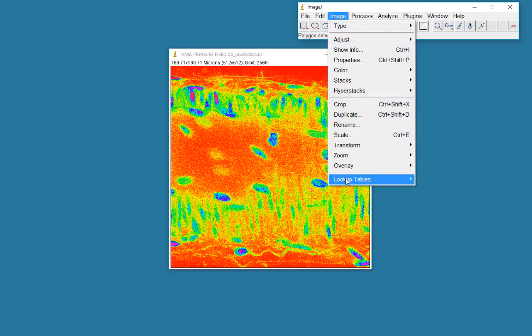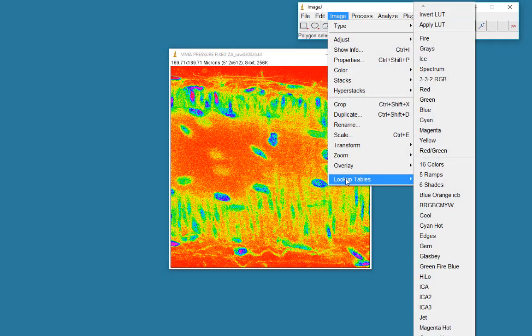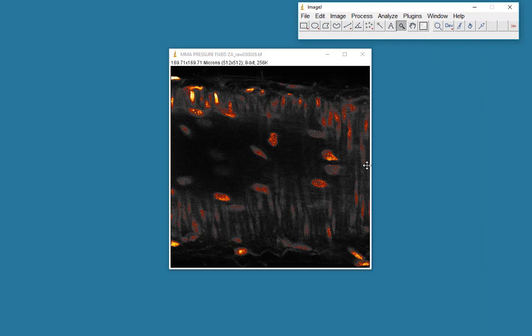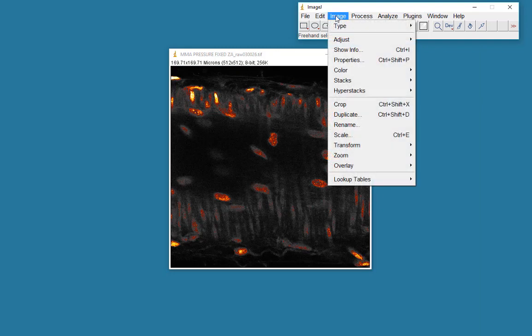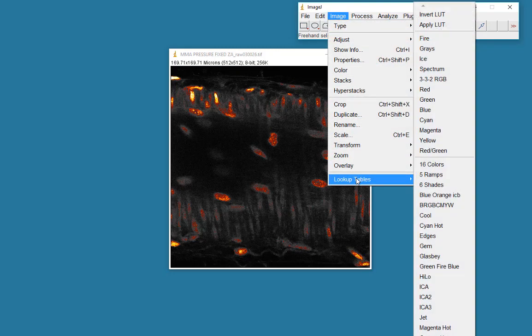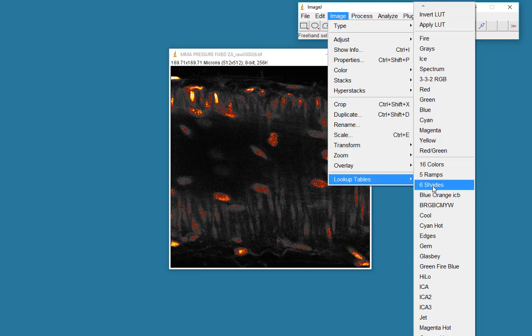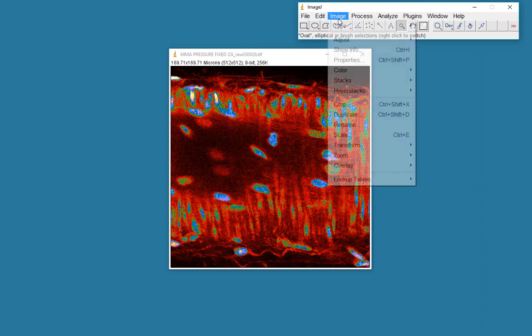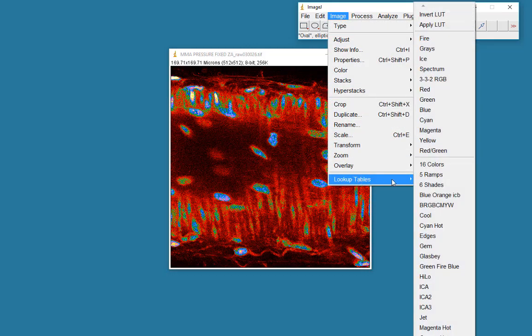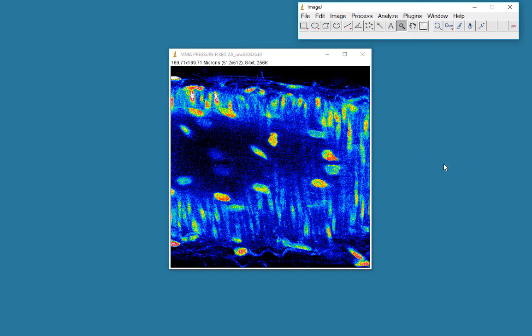Let's look at a few other different lookup tables. One of my favorites is the smart lookup table, which is quite nice for showing the brightest points. Maybe we want to just change the lookup table so that we have very few shades. Let's say just six shades. There are only six colors here. Maybe 16 colors. Sometimes quite useful.